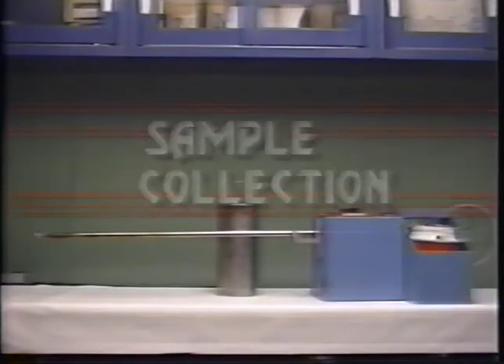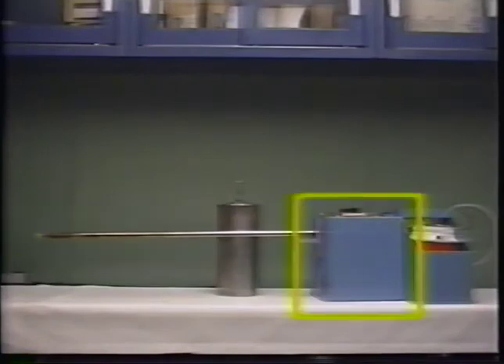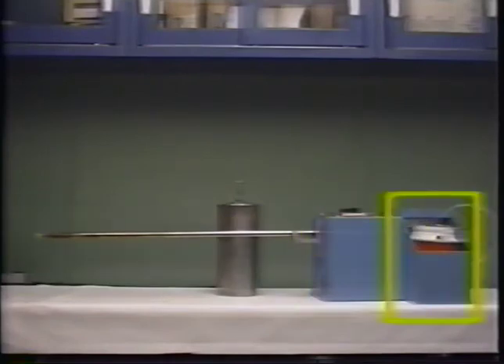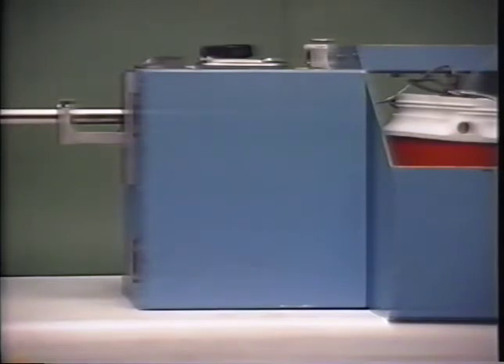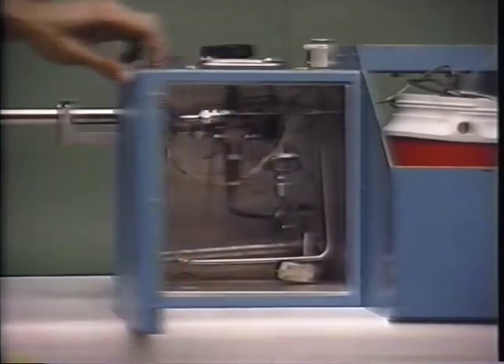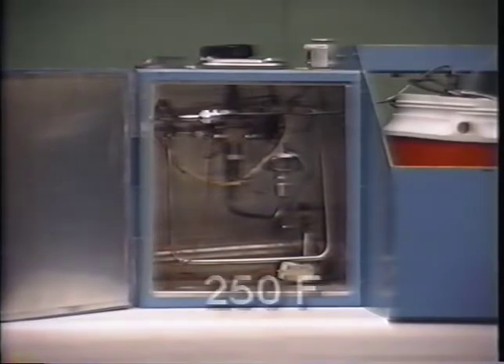During Method 25 sampling, the sample gas is extracted from the stack through a heated probe, a heated out-of-stack filter, and a dry ice condensate trap, and collected in an evacuated sample tank. The method was modified in 1988 to, among other things, incorporate an out-of-stack filter to remove organic particulate matter that can interfere with the analysis. The filter is maintained at a constant temperature of 250 degrees Fahrenheit, plus or minus 5 degrees. The filter catch is discarded.